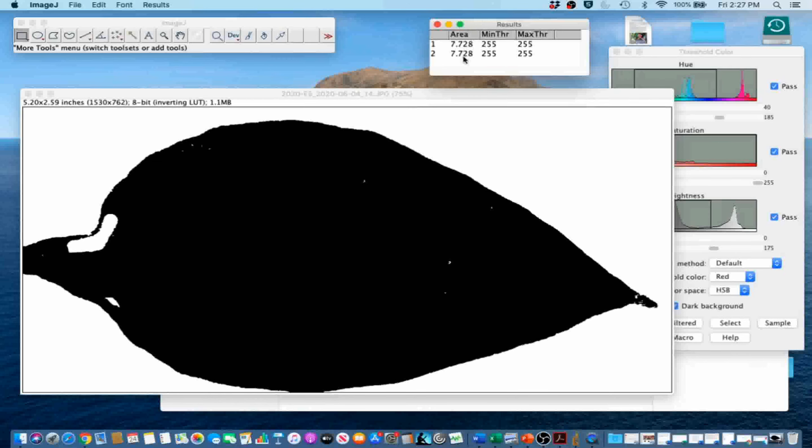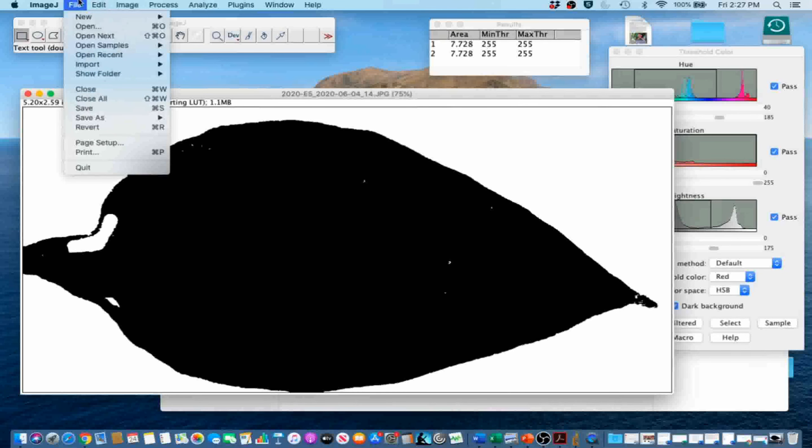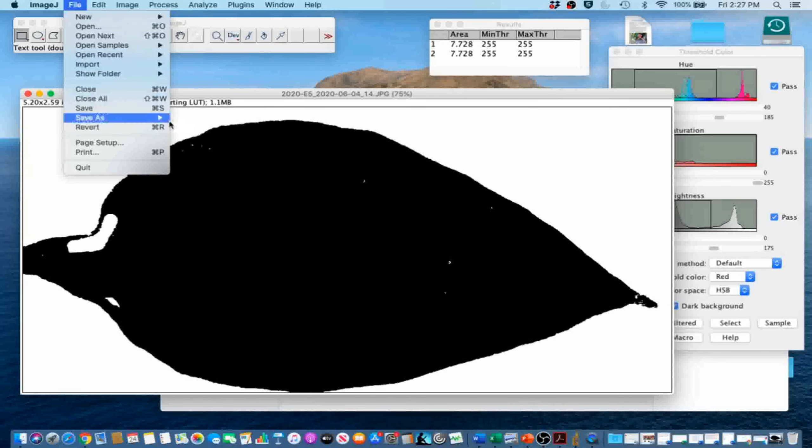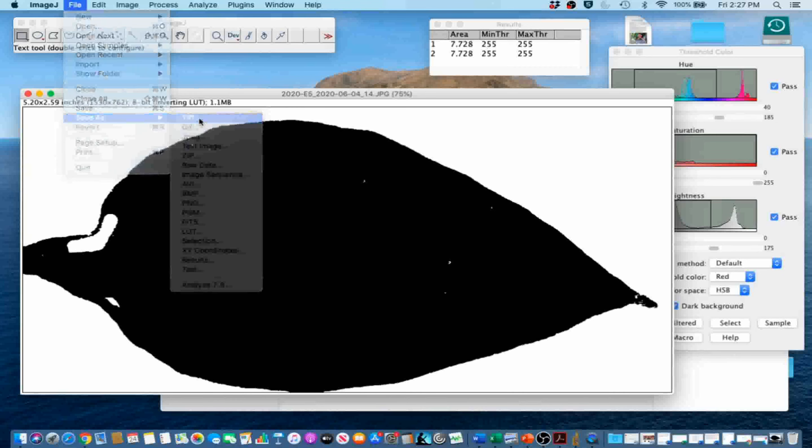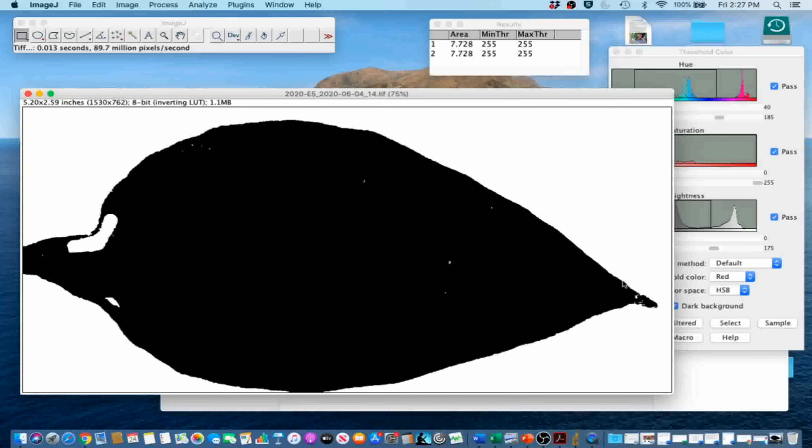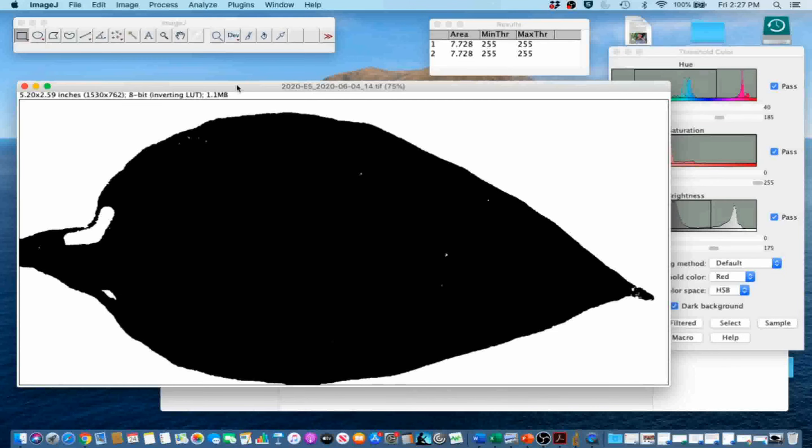We can go ahead and record it onto an Excel sheet. We can also save a copy of this image by going to File, Save As, and then selecting the extension that we want. In this case, I'll go ahead and take a tiff. Save it in the same folder location. And now I have the processed image as well saved onto my laptop.